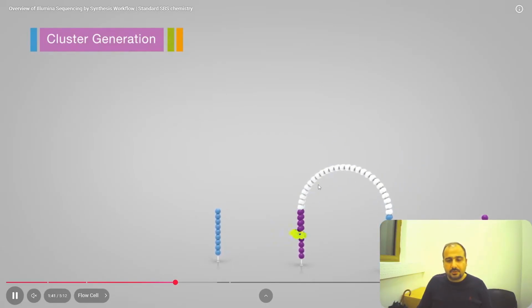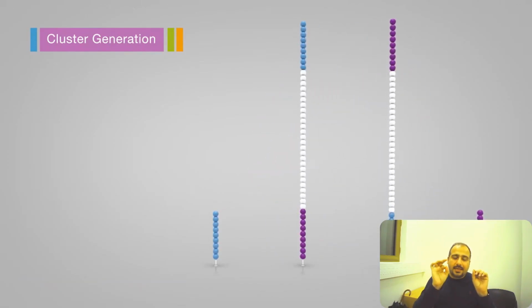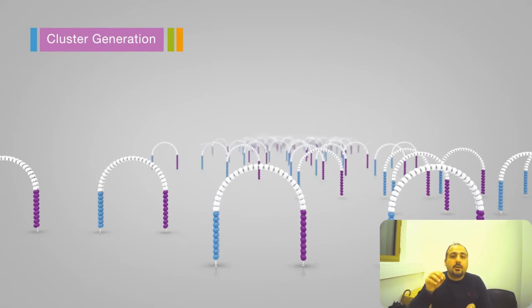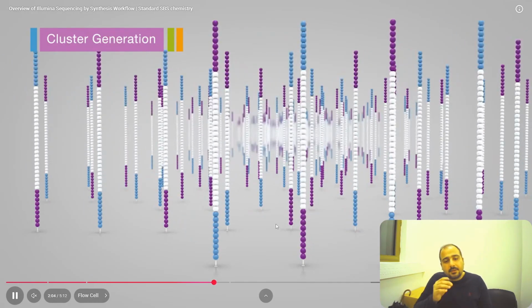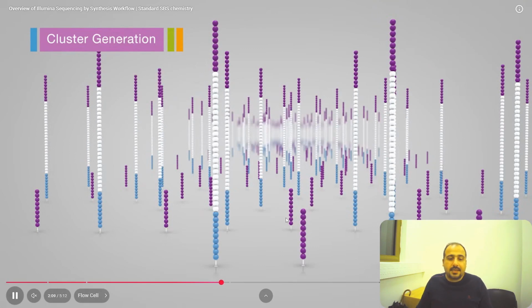Polymerase chain reaction, commonly known as PCR, is performed, and within a specific region of that particular lane, at a very small and distinct point, several molecular bridges are formed. PCR subsequently occurs, and a substantial colony of that specific DNA strand is created in that precise region of the flow cell, within that designated lane at that exact point, all facilitated through these bridges.